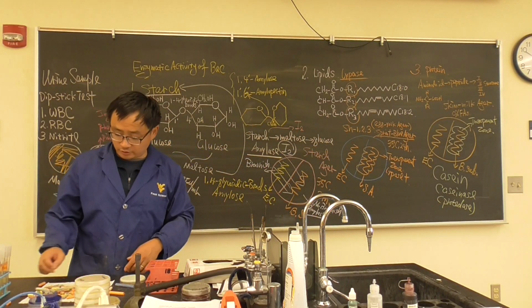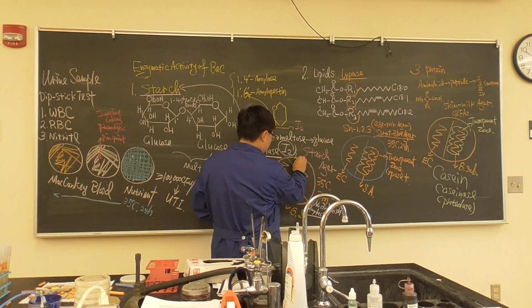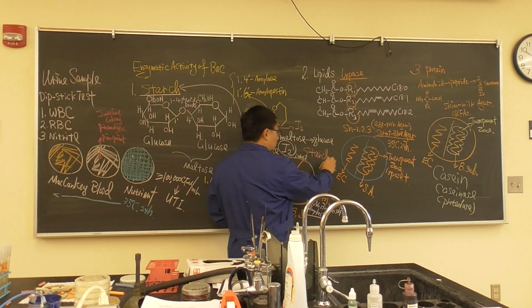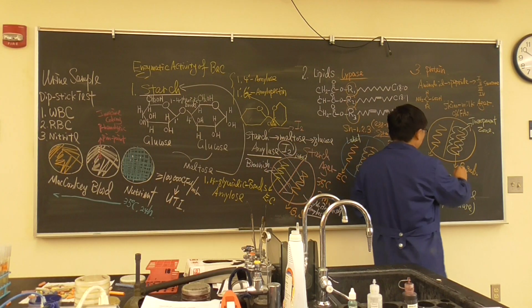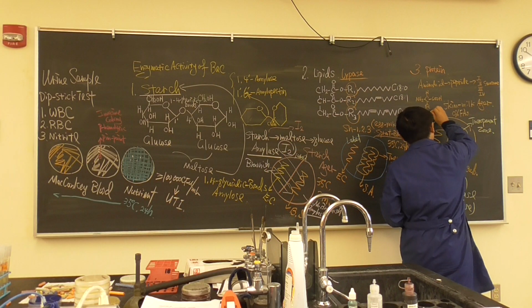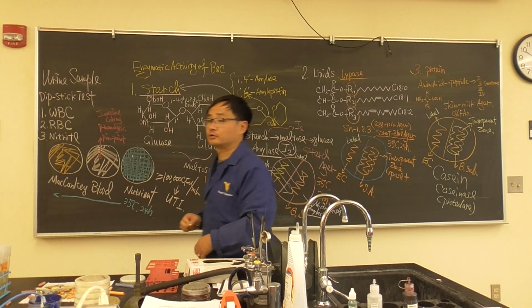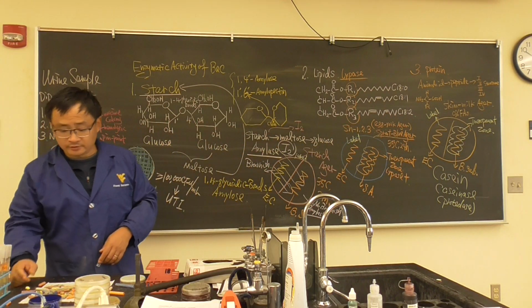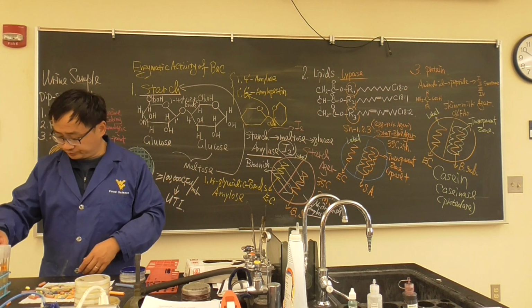Now, what else do we need to do? Don't forget to label, and don't forget to label on the back of the agar like you did before. Same thing as before.